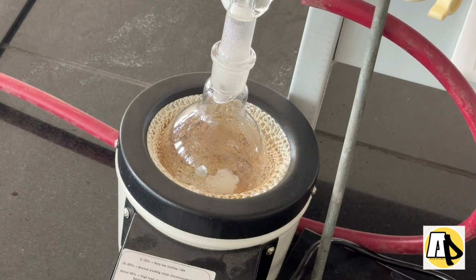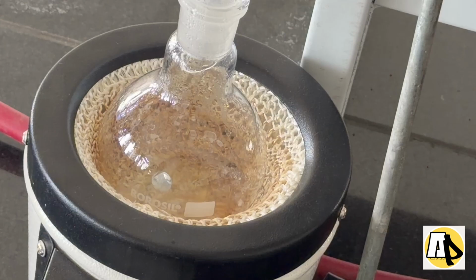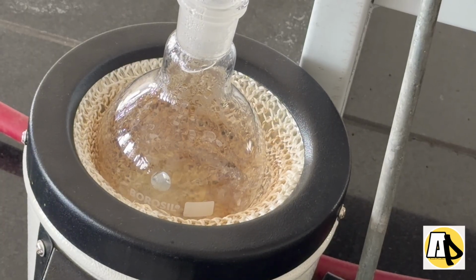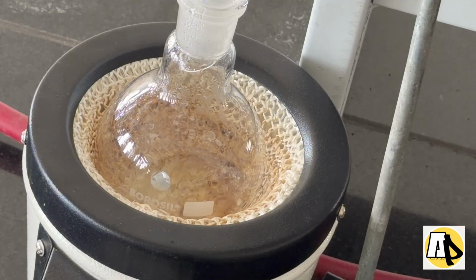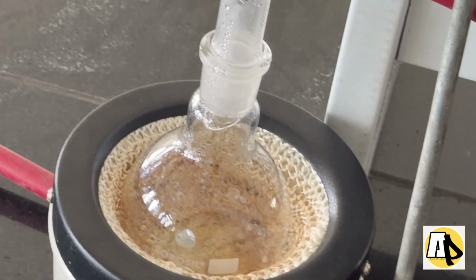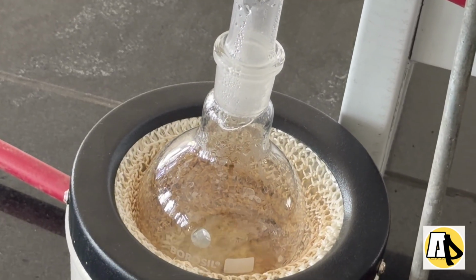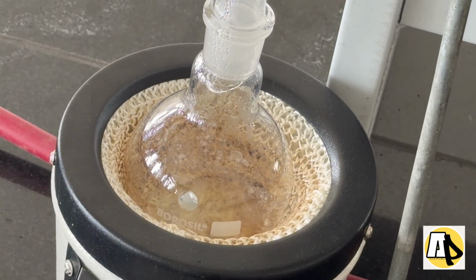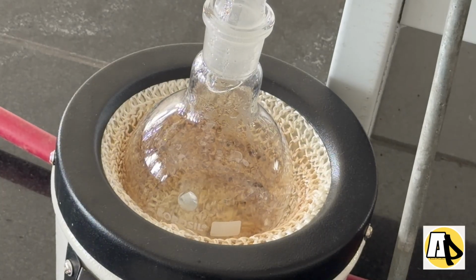You will see shortly. As you can see now, the whole of the methyl salicylate is solubilized and it is already getting refluxed. The drops are falling, and I can clearly say, since it is not 100 degrees centigrade, it is not water that is getting refluxed, but it is methanol.